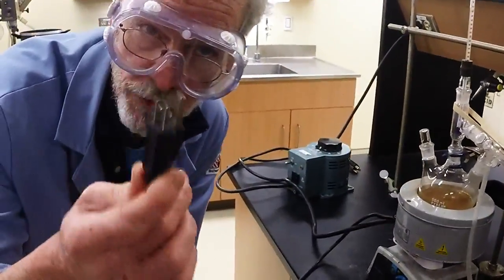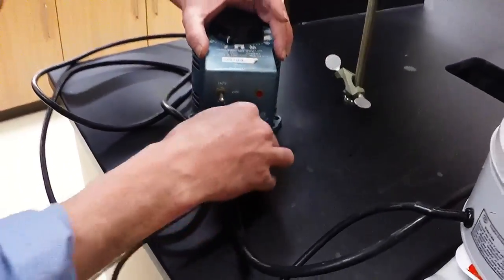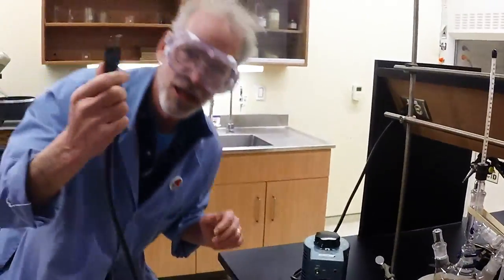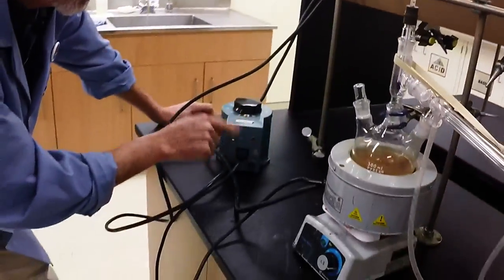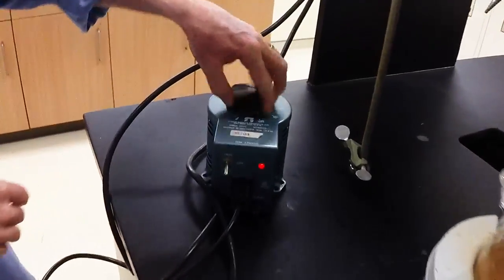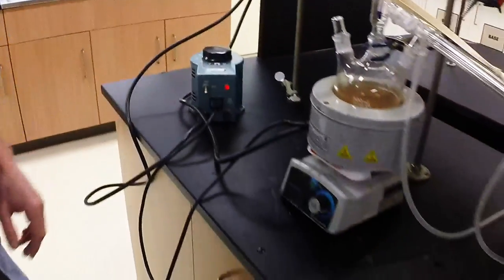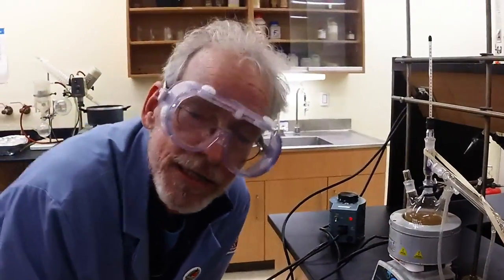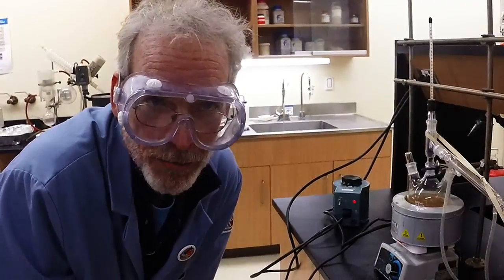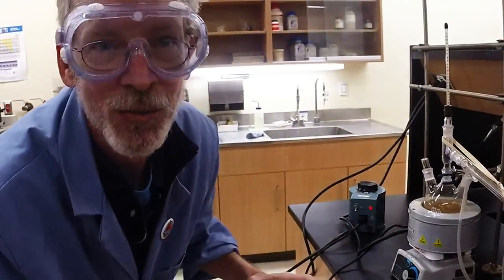The power for the heating mantle goes into the power supply. The power supply is plugged into the wall. We turn it on — I believe we're going to start about 60 or 70 at the 120 volt setting. And now we've got to wait for the water to boil, but that's why we started with hot tap water, so we don't have to wait as long.